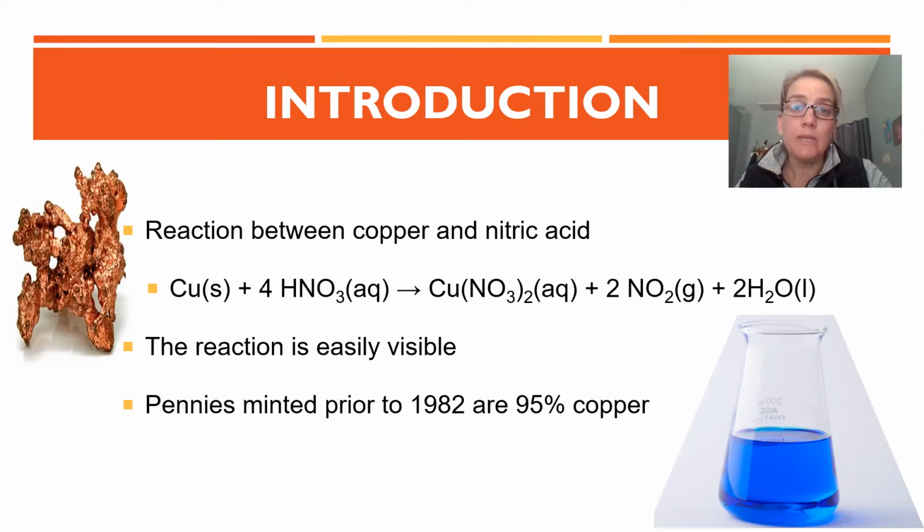All around us on a daily basis, chemical reactions are taking place. These reactions can be thought of as a rearrangement of the molecular structure of a substance, which eventually leads to the chemical transformation of one set of substances to another. The ensuing presentation demonstrates the chemical reaction between nitric acid and copper and explains the mechanisms of the reaction.